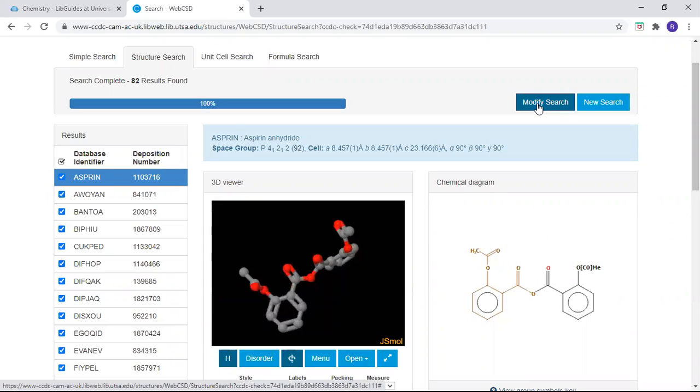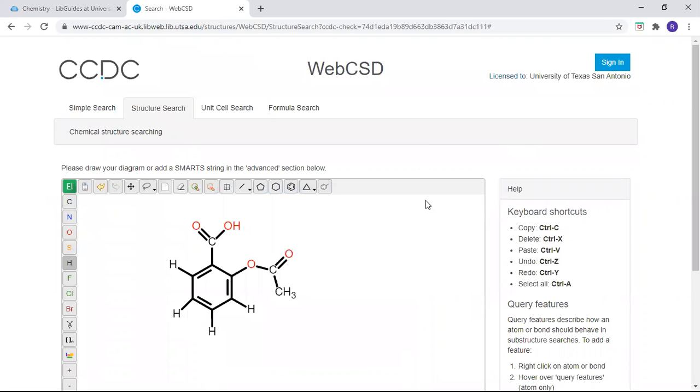Since we're next, we're going to look at salicylic acid and salicylic acid with copper. So let me show you the structure of salicylic acid. You'll do the same thing as with acetylsalicylic acid, except that I'm using copper and salicylic acid just as an illustration.